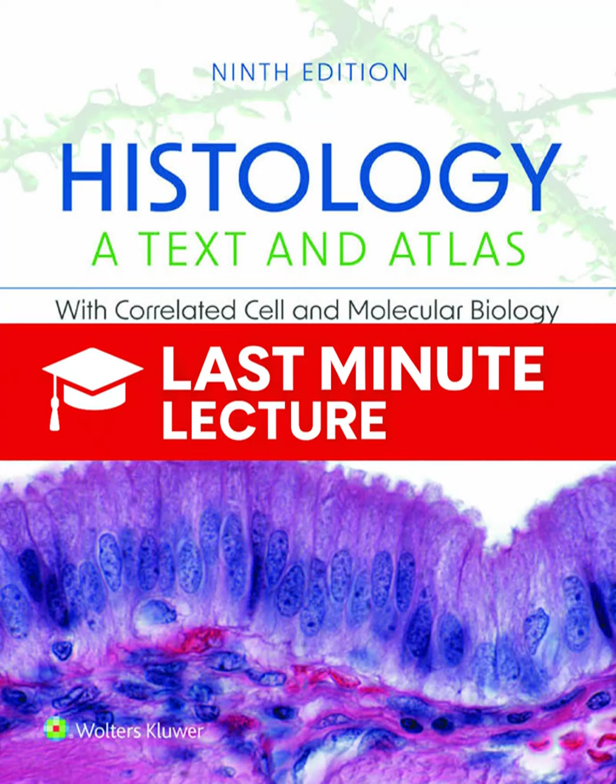Then comes the expansion. You just add pure water. The hydrogel is super hydrophilic, so it sucks up the water and swells, causing this isotropic expansion. It pulls apart equally in all 3 directions and increases the volume by more than 100-fold. And what does that buy you in terms of actual resolution? A huge gain. You can routinely get a linear expansion of up to 4.5 times, which pushes the light microscope's resolution down into the 60 to 70 nanometer range. Which is incredible. It is.